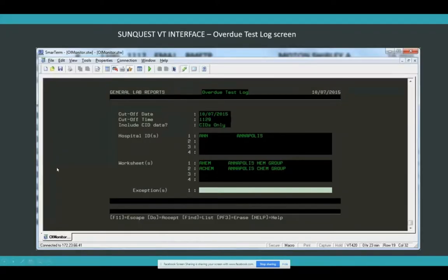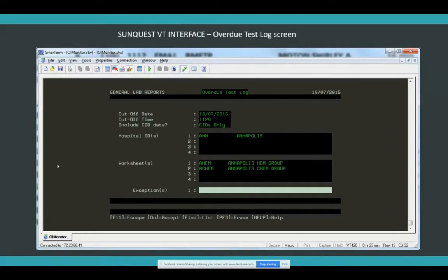Here's what the VT interface looks like in smart term. You may be familiar with this — you may be pulling your overdue logs this way. This can all be automated, and not only that, not just to display it on the screen or automate printing. The OL Monitor application automates this and continuously updates it, so you don't even have to mess with it.